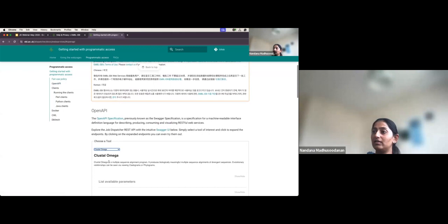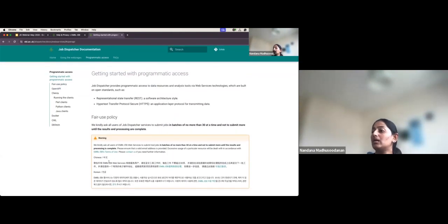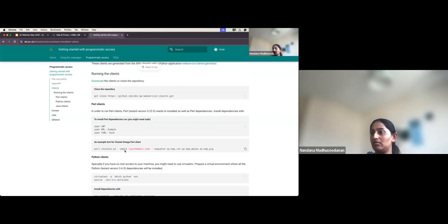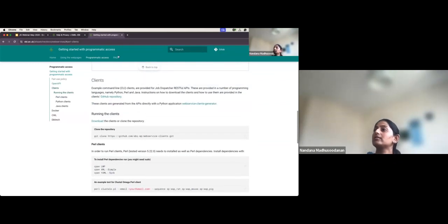I'm not explaining programmatic access in today's webinar, but we have a policy in place for our programmatic access users: we request you to submit 30 jobs at a time, as a fair use policy. There are a few examples as well on how to use our web service clients.